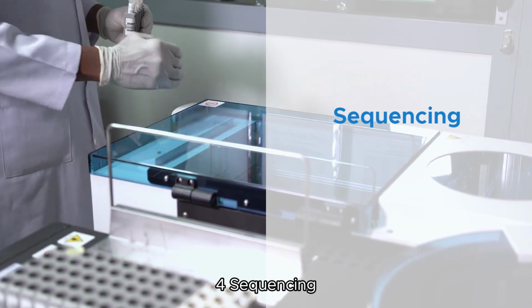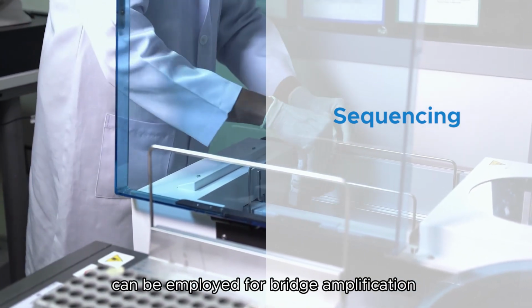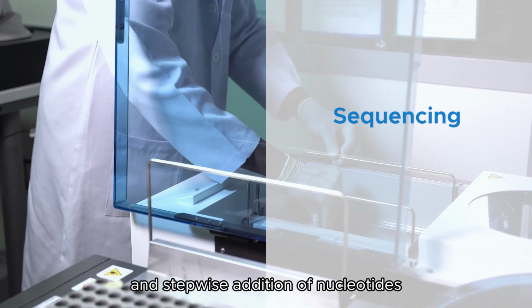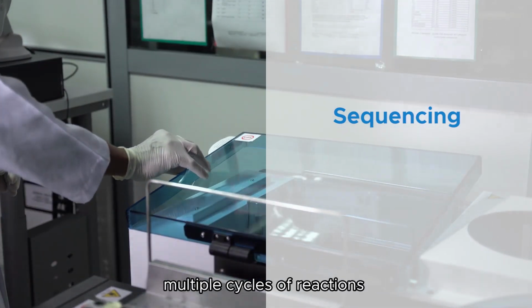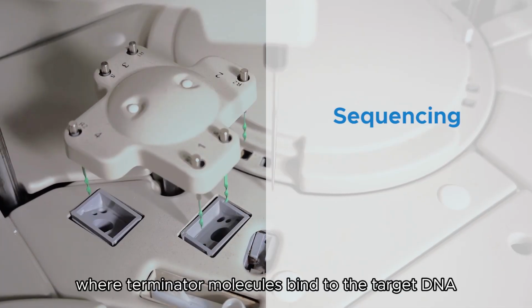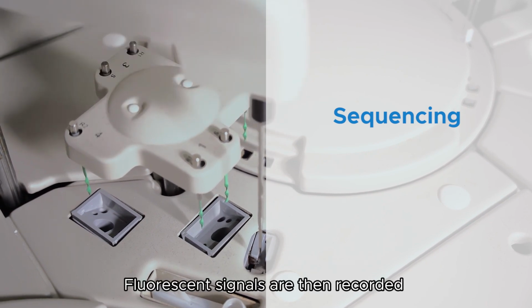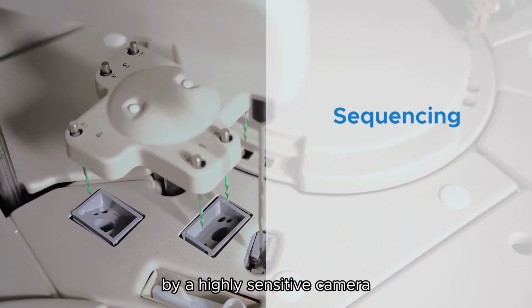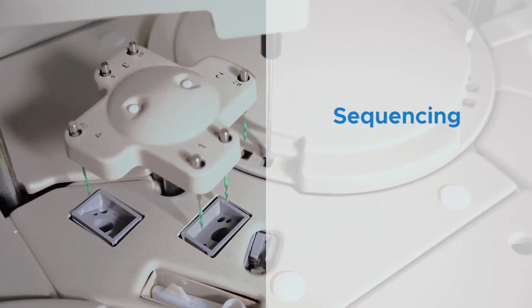4. Sequencing. The Illumina sequencing platform can be employed for bridge amplification and stepwise addition of nucleotides. In this process, the single-stranded DNA undergoes multiple cycles of reactions where terminator molecules bind to the target DNA and nucleotides are added one at a time. Fluorescent signals are then recorded by a highly sensitive camera, converting the obtained information into sequence data.